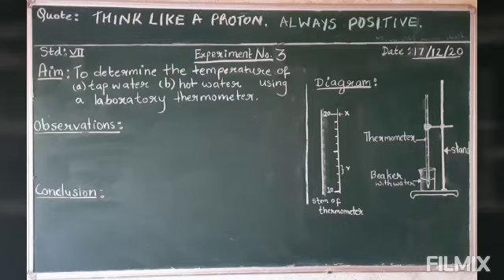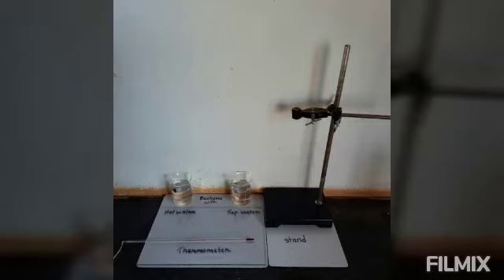Hello students, today we are going to perform experiment number three. The aim of the experiment is to determine the temperature of tap water and hot water using a laboratory thermometer. Requirements are two beakers — one with hot water and one with tap water — a thermometer, and a stand.